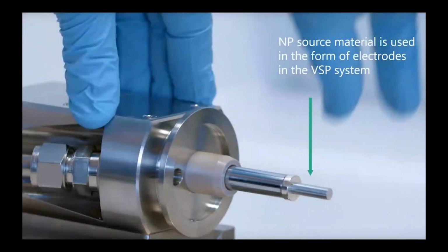The nice thing about this process is that you can just select the type of material that you want to make into nanoparticles and put it as a solid electrode, the tip in this image, into the system. So switching between synthesizing gold nanoparticles or platinum nanoparticles is just a matter of minutes that you need to replace the electrodes.